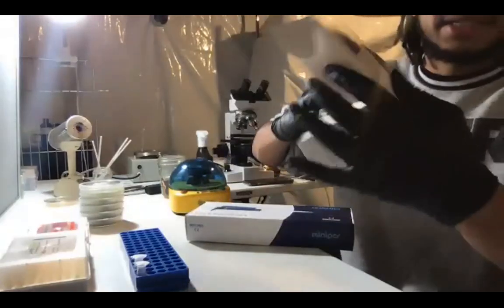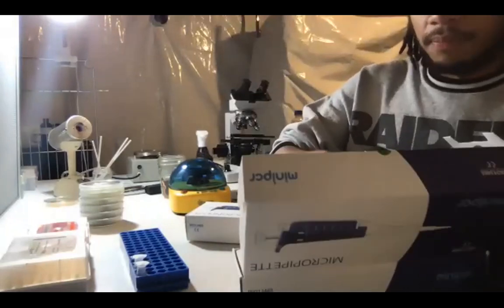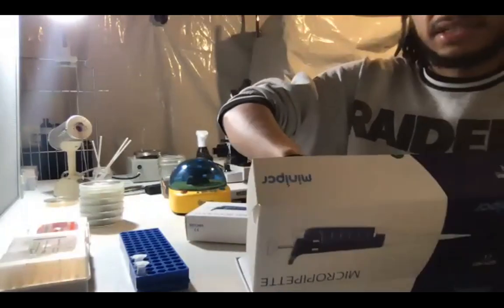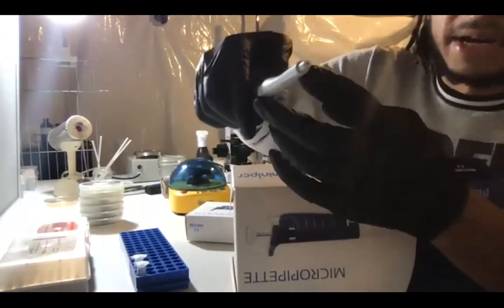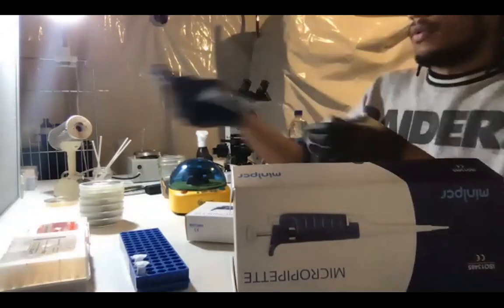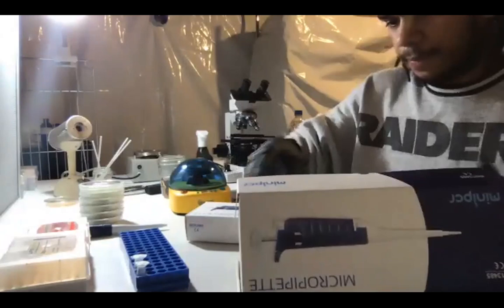I store my pipettes in these boxes because I don't have a pipette holder. You just want to make sure you keep your pipettes in a safe space so that nothing happens to the ends. You don't want to damage the end of your pipette. So you don't want to just like leave them out if you're not using them. You don't want any dust to get in there or anything like that.